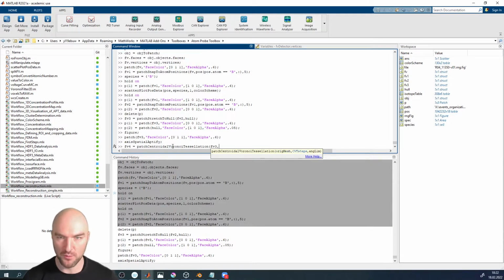How many steps do we want to do? Well, let's start with 1. And then at the end, you will find something called angle limit. And the reason why there is something called angle limit is because we're not going to do it on a fixed domain because it doesn't make all that much sense. It's not that applicable for our problem right now because we're outlining something to the entire boundary, to the dataset boundary.